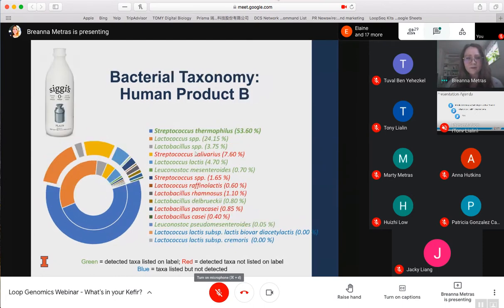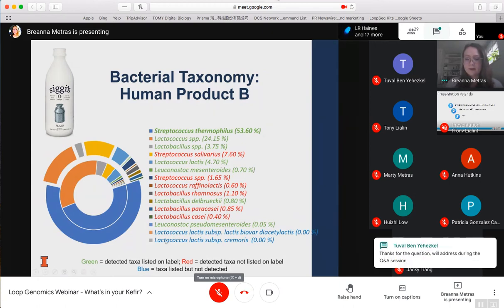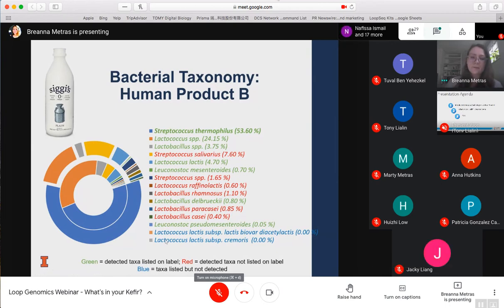The next one was Siggi's, which I'm sure you guys have seen in the store. I know I have, probably one of my favorites tasting wise. Again, their top 3 were claimed, so that was a lot more accurate, which is great. And again, we have a good handful of species that were found via Loop but were not claimed on the label. And then our last 2 products were listed on the label, but not detected. So the new updated sequencing could actually have some of that information.